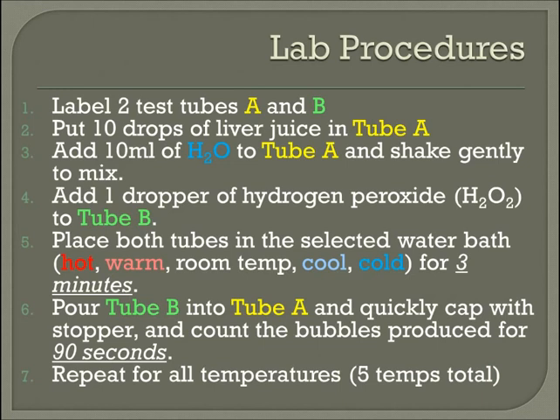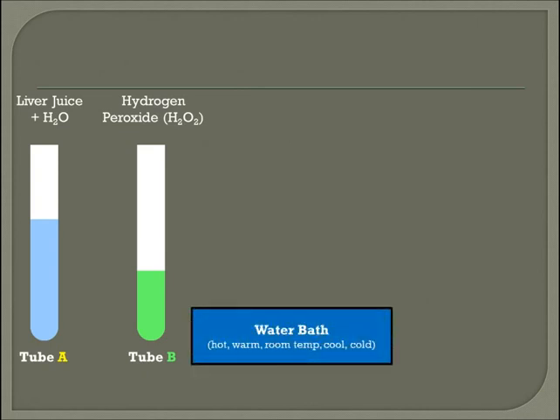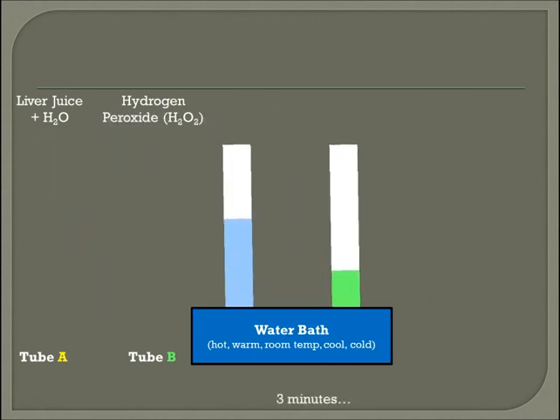You're then going to repeat this for all the different temperatures, with 5 temperatures in total. Here I have tube A, which is liver juice and water, and tube B with one dropper full of hydrogen peroxide. I'm going to take them and put them in my water bath — 5 different temperatures: hot, warm, room temp, cool, and cold — and shake gently for 3 minutes.